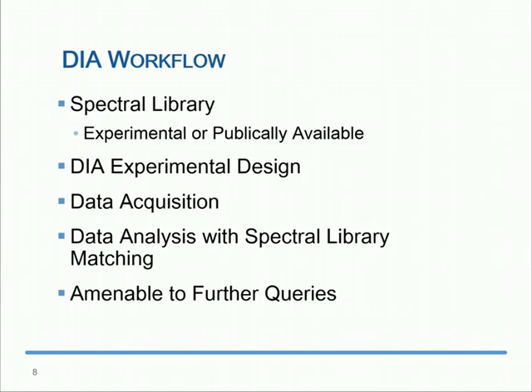It would be another great place to develop a spectral library that would have both cancer-relevant proteins as well as tissue-relevant proteins. We have the DIA experimental design, which can be one-size-fits-all, or as we'll talk about a little bit in this seminar, tuning it and tailoring it to exactly making the measurements that you want. Have strategies for data acquisition and then data analysis with spectral library matching.